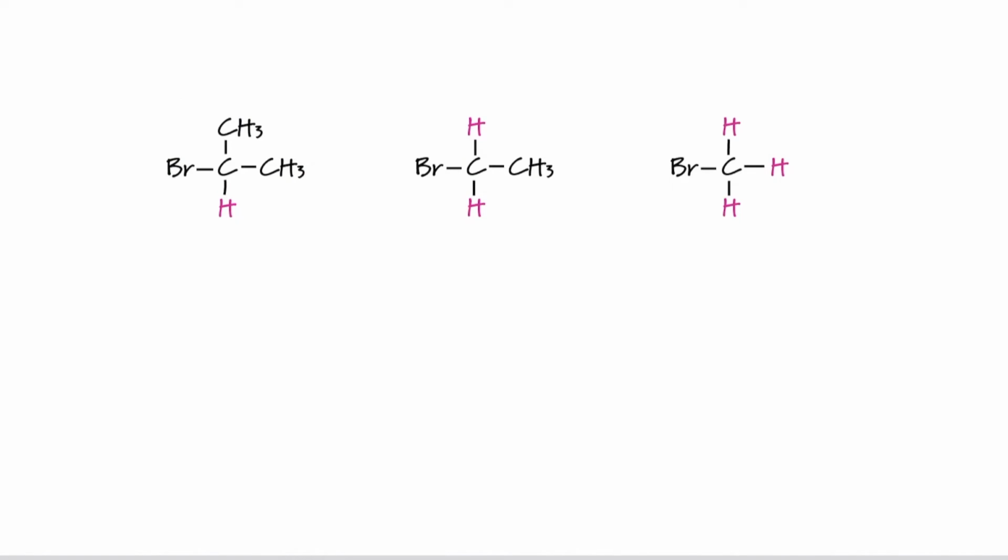We can also use the chemical shift data to determine whether a proton is part of a methyl group, i.e. CH3. So this is methyl, and we'd expect to see a chemical shift of around 2.7 parts per million. It's a part of a CH2 group, so that would be methylene.